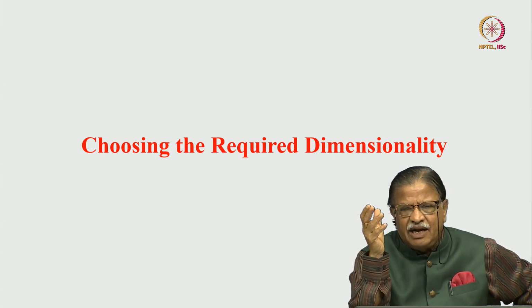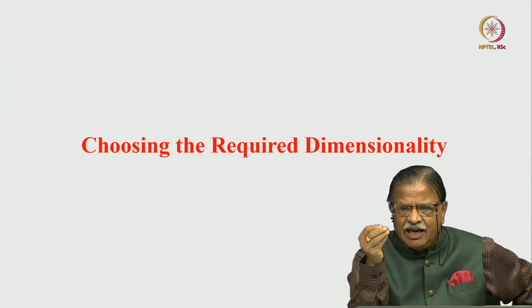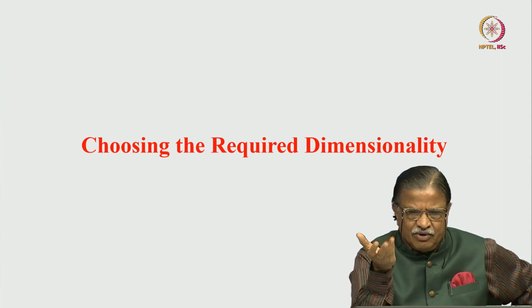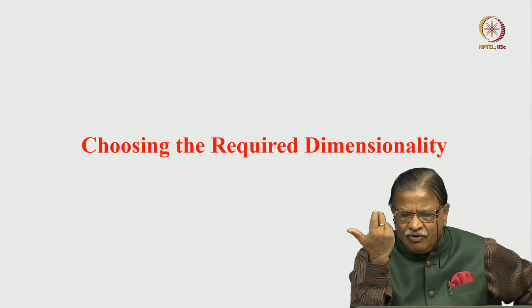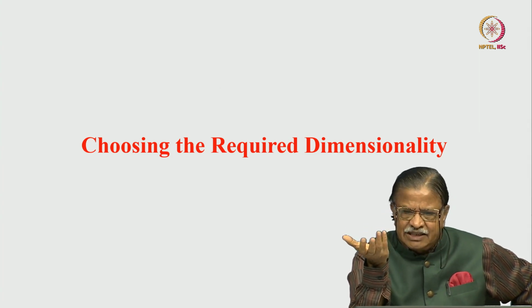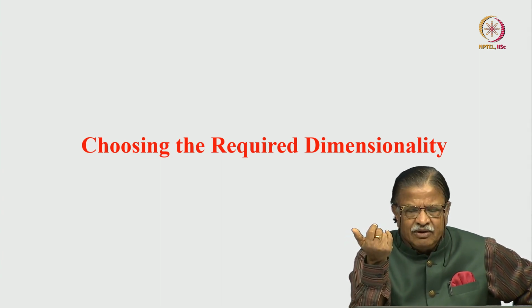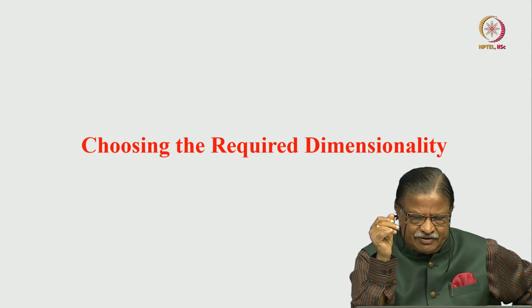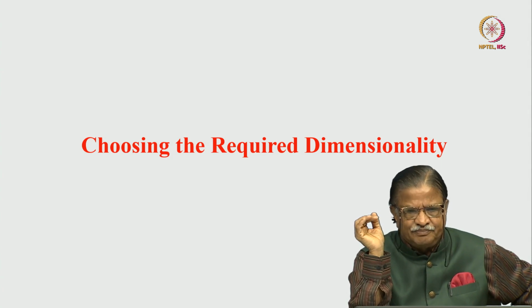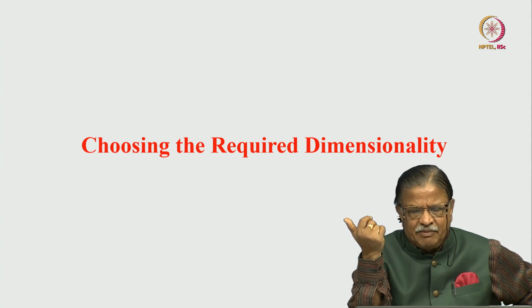And of course, dimensionality of NMR depends upon how much time constraint there is. I explained to you. 2D NMR may take a few minutes, 3D NMR may take 1 or 2 hours, 3 hours like that. 4D takes days, 5D takes weeks. And also resolution enhancement, and sensitivity goes by the square root of the measurement time. So there are certain restrictions involved in this. It also depends upon the molecular size. That also I explained to you. So what is the size of the molecule you have to use for getting the different dimensionality.